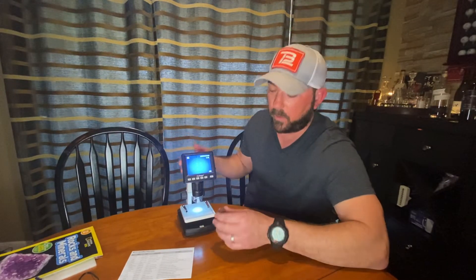I forgot to mention that this also comes with a memory card, which is really neat, and you don't have to purchase this separately. Once you turn it on and get everything set up, whenever you find something you like, you just take the picture and it stores all what you've done research on. This microscope has basically three or more ways to focus.